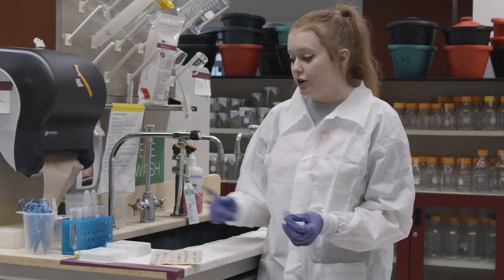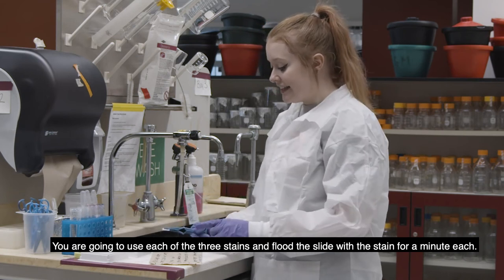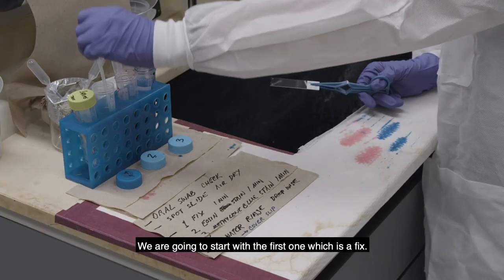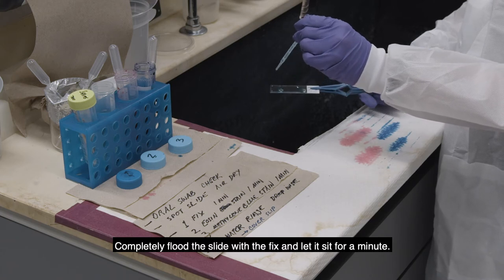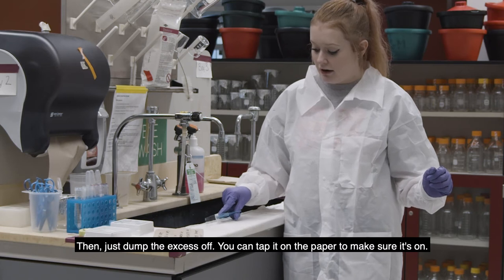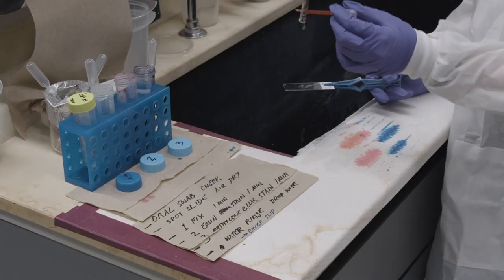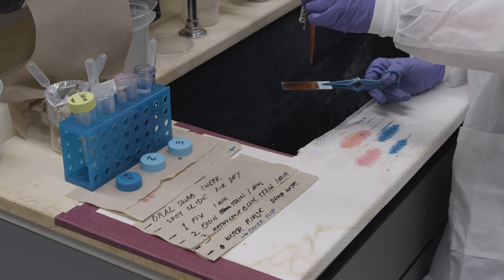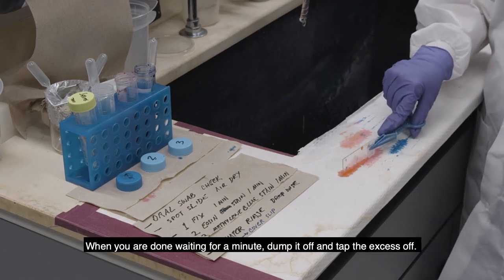So after swabbing your cells on the slide, you're going to stain your cells now. So we'll have forceps here. So you're just going to clip your slide into the forceps. And then you're going to use each of the three stains and flood the slide with the stain for a minute each and then dump it off and then put the next one. So we're going to start with the first one, which is a fix. So just completely flood the slide with the fix. And then just let it sit on there for a minute. And then just dump the excess off and you can tap it on the paper to make sure it's off. And then next you're going to add the eosin stain. So again, just flood the slide for a minute. And then when you're done with the minute, dump it off and then tap the excess off.